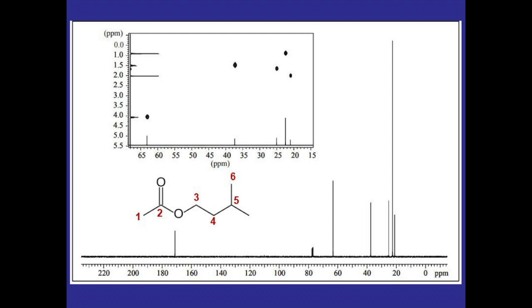Looking at the peaks now, you'll actually count 7 peaks, which doesn't match up with these 6 unique carbons, but this small grouping of 3 peaks around 77 ppm is actually being produced by the solvent, which would be deuterated chloroform, or CDCl3. And now there are 6 remaining peaks, which matches up with these 6 unique carbons. To analyze those peaks, you won't be able to use splitting like we did with the proton NMR, but you can look at the chemical shifts.